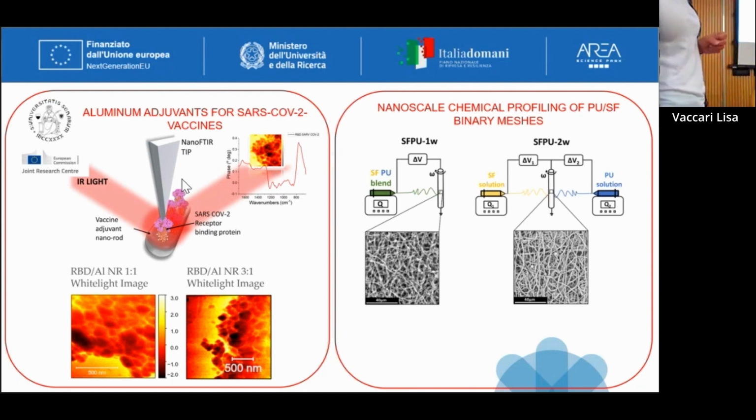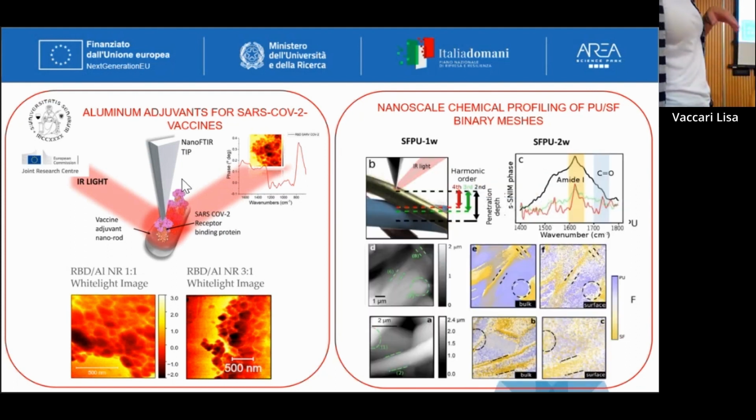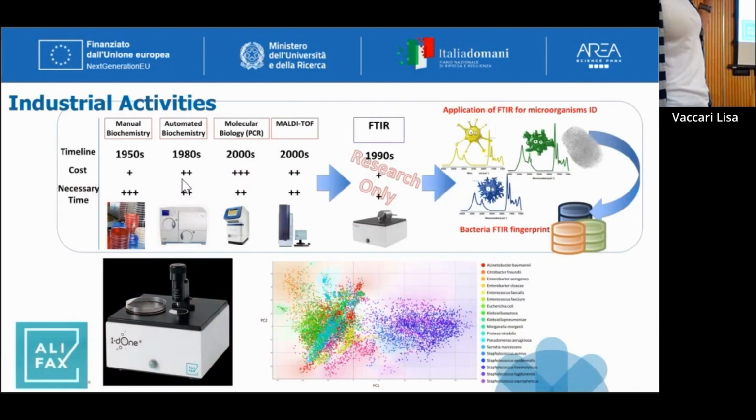So the other example I won't tell you. I just want to tell you something for reconnecting with the point of care analysis. One of the parts of the PRP CERIC project, on the work package that is mostly led by the omics part, is the attempt to exploit infrared spectroscopy for making an easy device for point of care analysis.